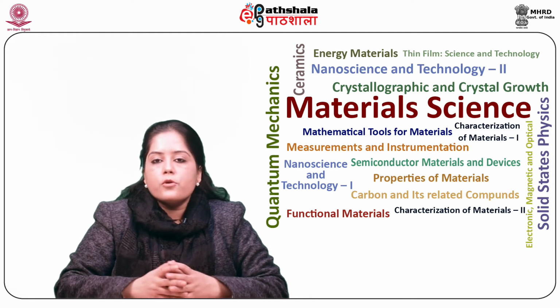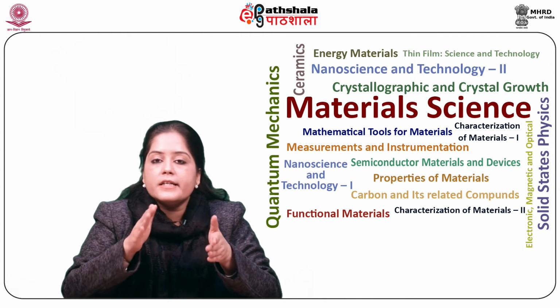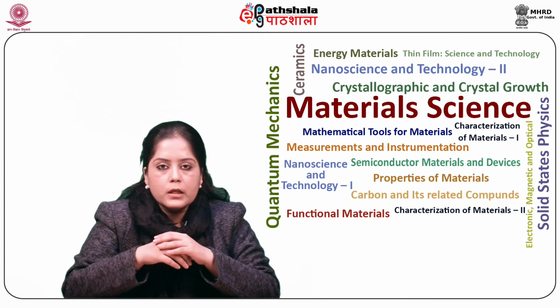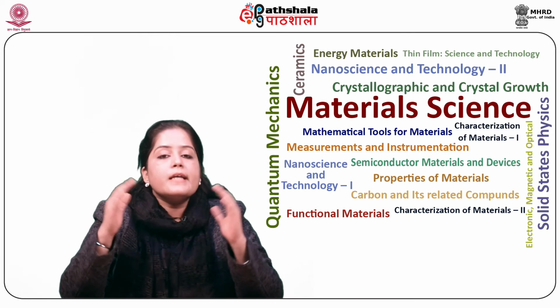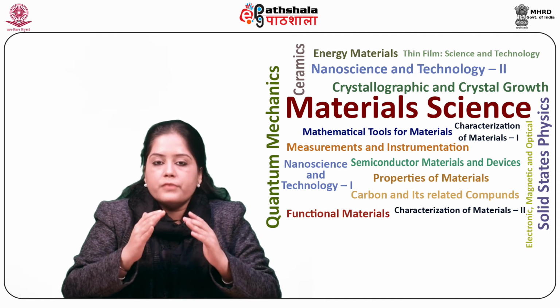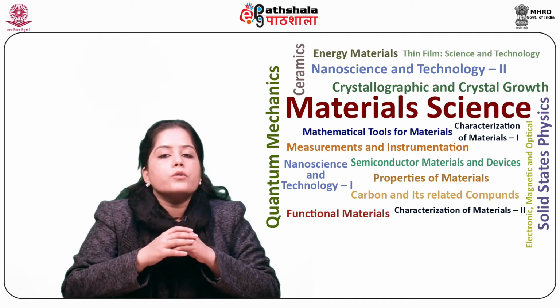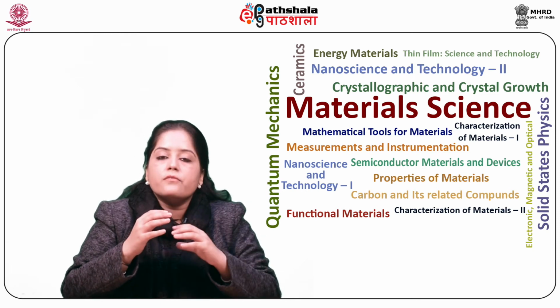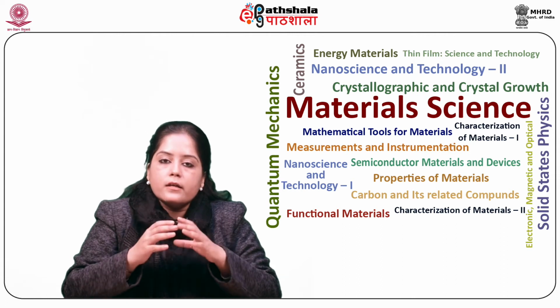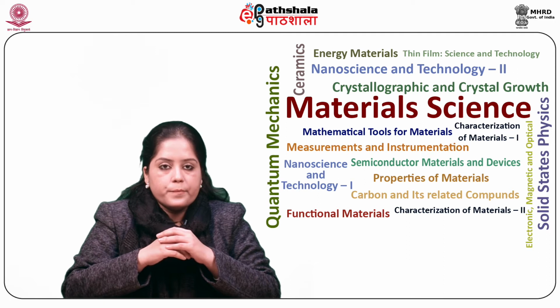Piezo response force microscopy (PFM) is based on the mechanical deformation of the sample due to the converse piezoelectric effect. The application of the electric field leads to thickness changes and or to shearing of the material depending on the direction of the electric field together with the piezoelectric tensor elements.